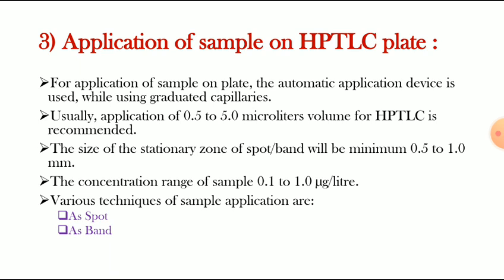Spot means circular in nature, and a band will be in rectangular form. By these two techniques, the sample is applied on the HPTLC plate.